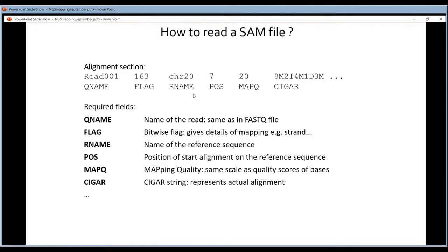I will come back on that. You will see where the alignment starts. This starts on chromosome 20, position 7. You will get a quality score for the mapping. This is a score that you interpret in the same way that you interpret the base quality scores. 20 means 99% confident. Then you have the CIGAR string. The CIGAR string represents the actual alignment. I will come back on that.